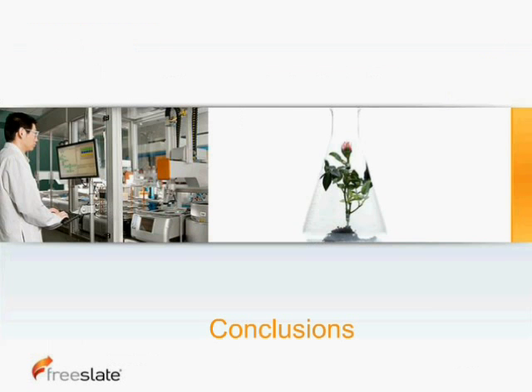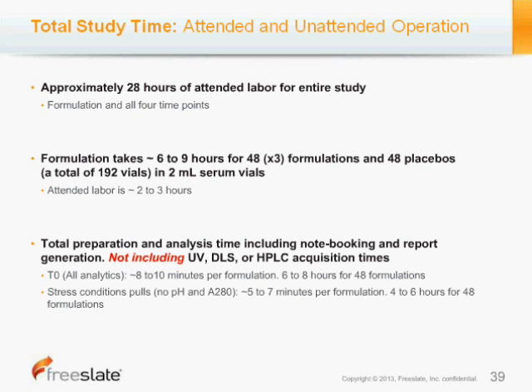Okay, so now we'll go into the conclusion section. Basically, the big take-home message from Freeslate and the automated tool side of this is that this study takes only about 28 hours of attended labor. That includes the formulation of all 192 vials, and it includes all time points. Now, that being said, that's just the attended part.